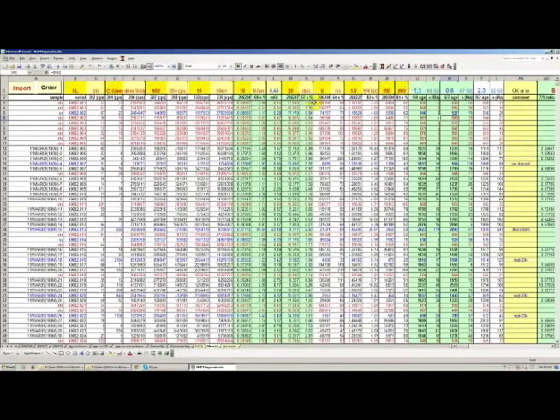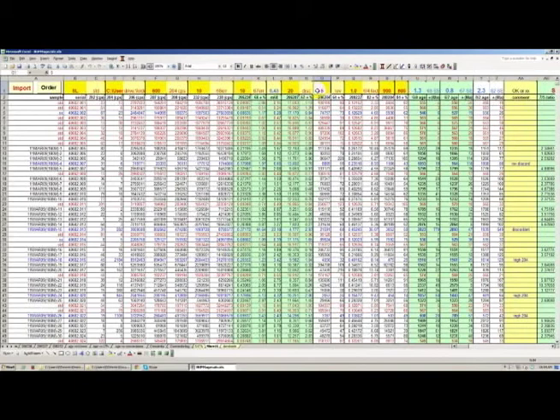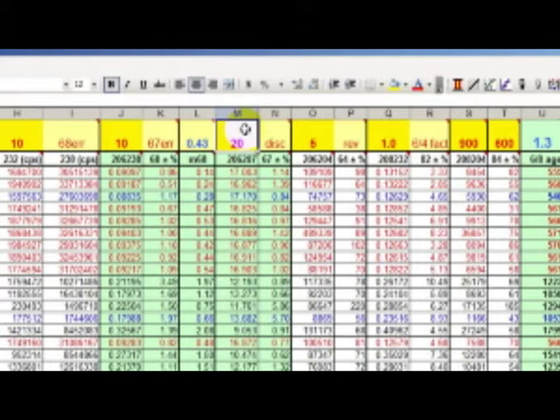So we typically have set a threshold for 5% reverse discordance. So anything that is more than 5% reverse discordance is going to get highlighted and discarded. We usually have a 20% discordance filter for normal discordance, but as we go further into your data set, you'll be able to see that we can tweak this a little bit depending on your particular data.